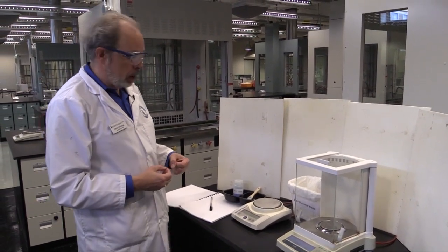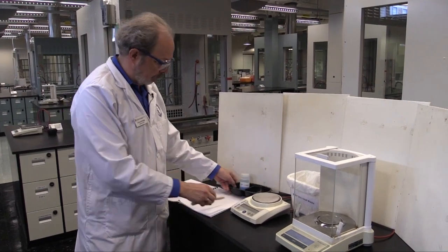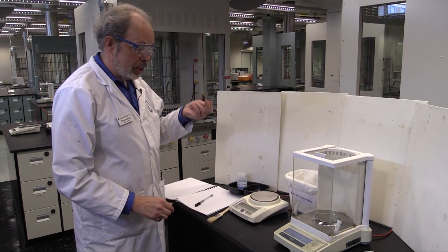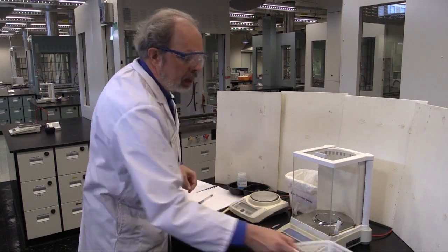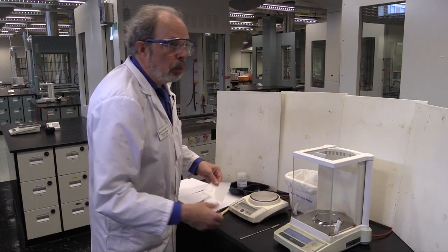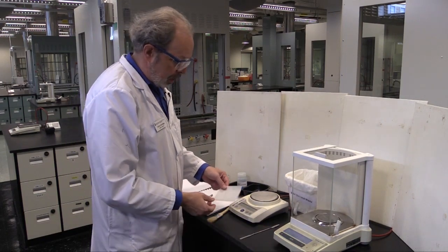Now what you will need when you are weighing is chemical, your notebook and a pen, a spatula and a weighing paper. You can also use a watch glass or a small beaker. I'm going to use a weighing paper here.